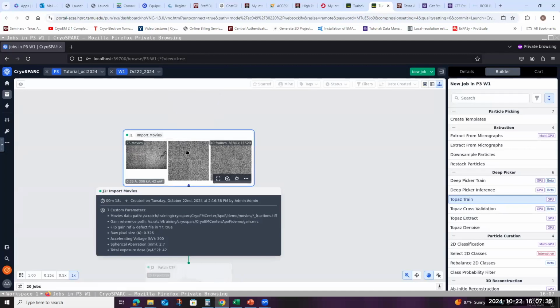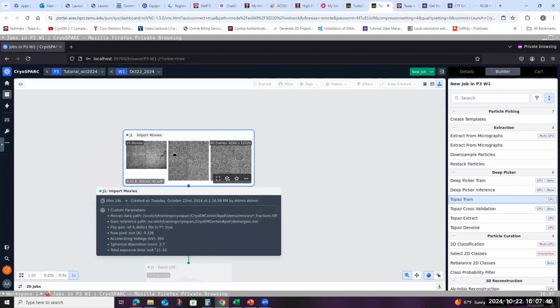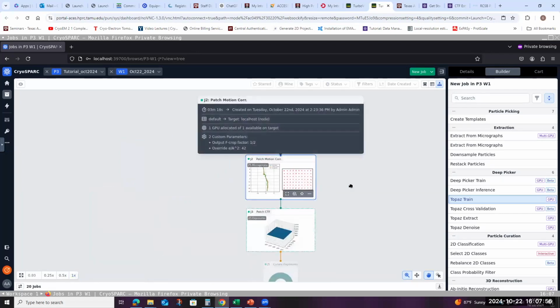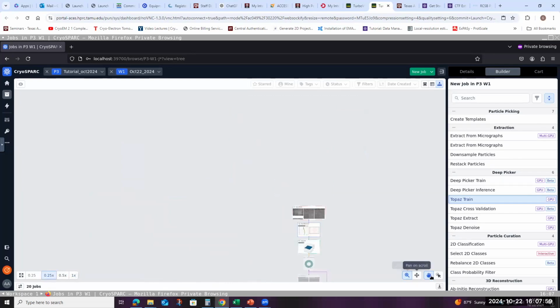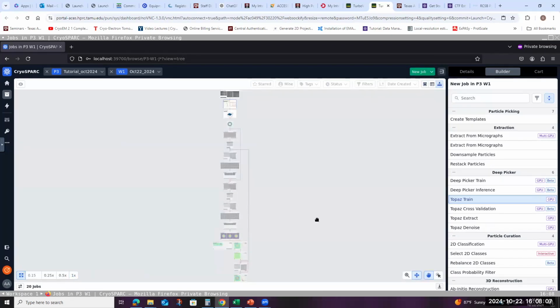Could you export this? It will export, but it will not export the parameters you see when you hover your mouse over the dot. When you export, it exports as a PDF. That's something we might add to the short course page, so someone can follow along and see the steps, because there are a lot of steps here, and it would help if they had a flow chart. You can download it.